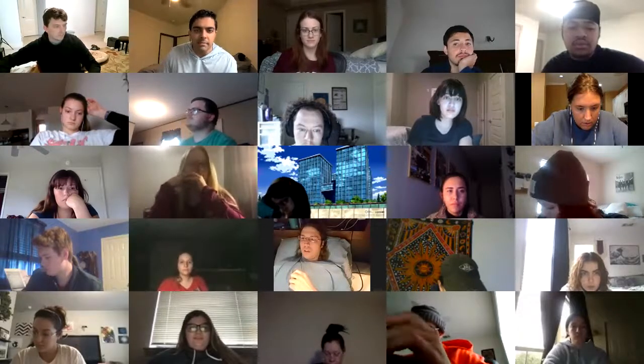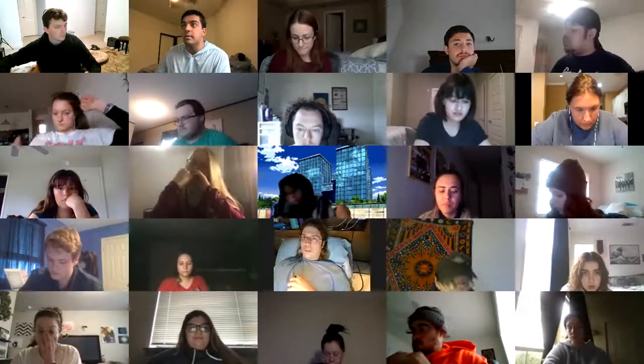Right, Gavin just put the melting point and the mass of your product in the chat. You should probably write that down because that'll be in your final conclusion for the lab.